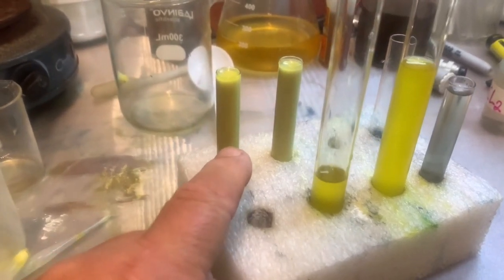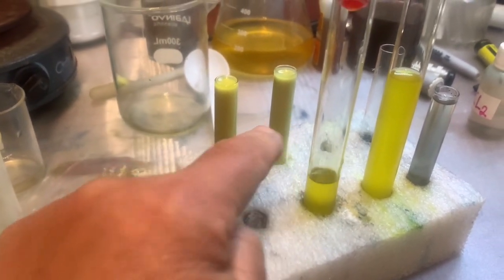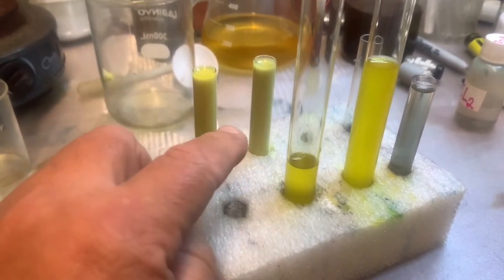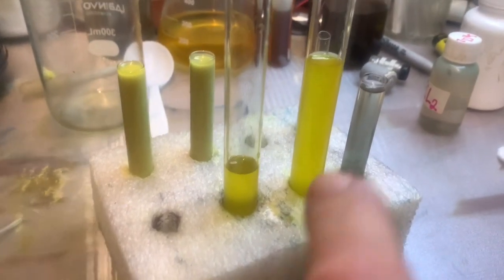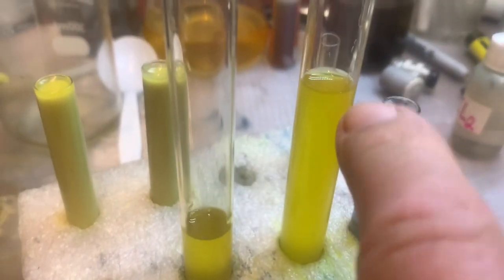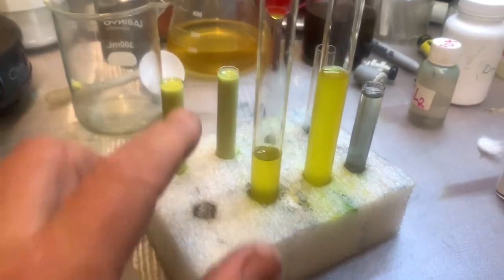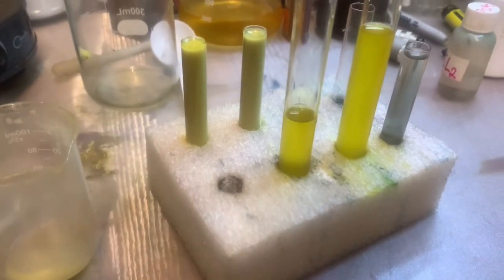Look how much silver chloride in both those beakers. I transfer everything to the beakers to let them settle down, because another way I can't filtrate. Even filtrating, I still get a not clear solution. Right now it's going fast because I just took all the top solution, and this on the bottom is silver chloride, it always bothers me.